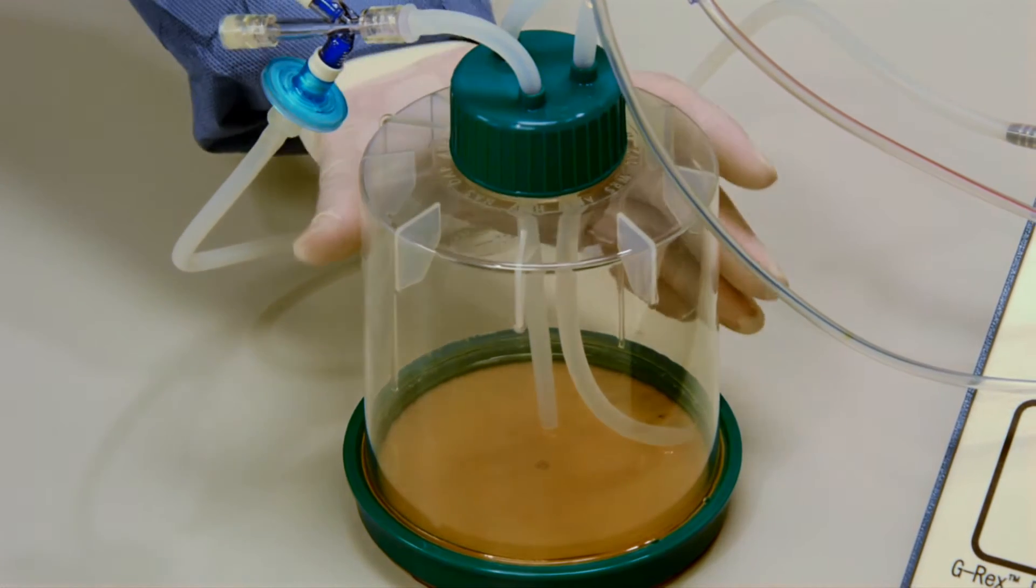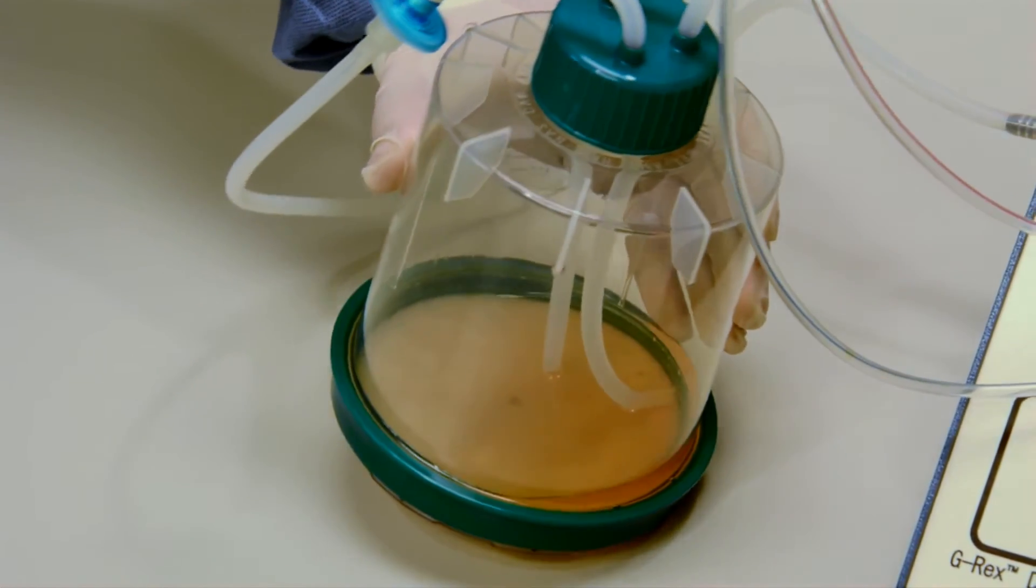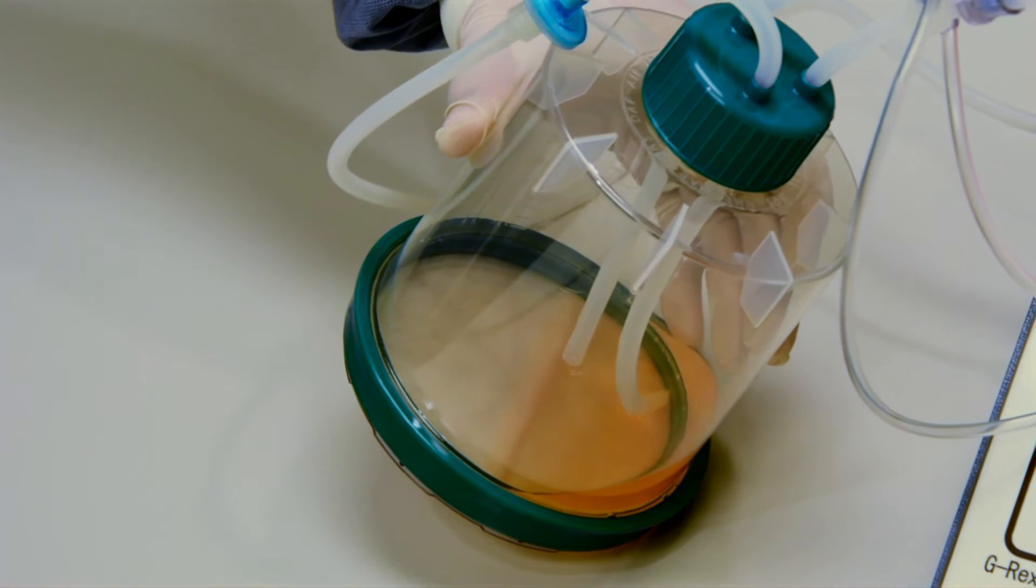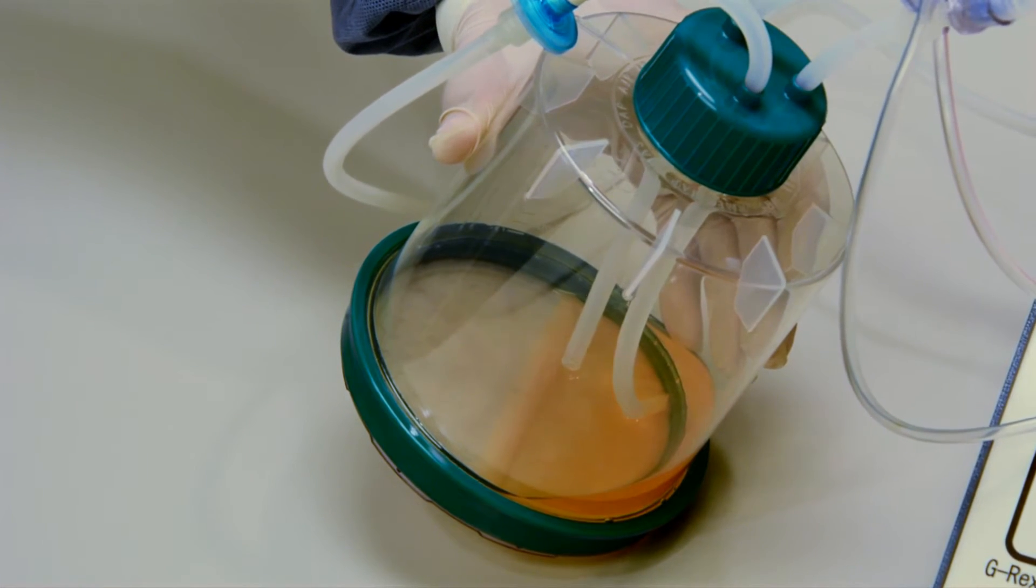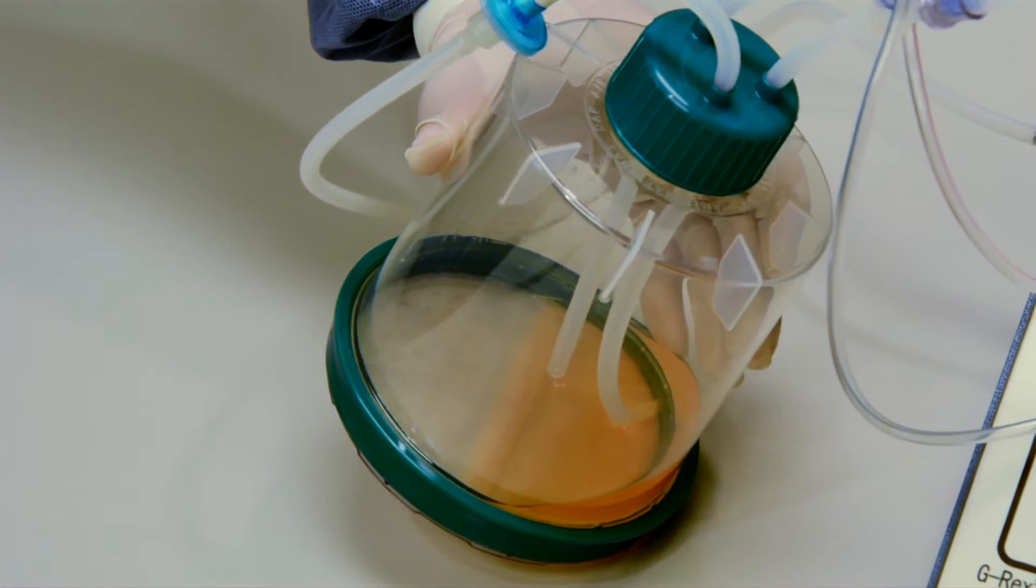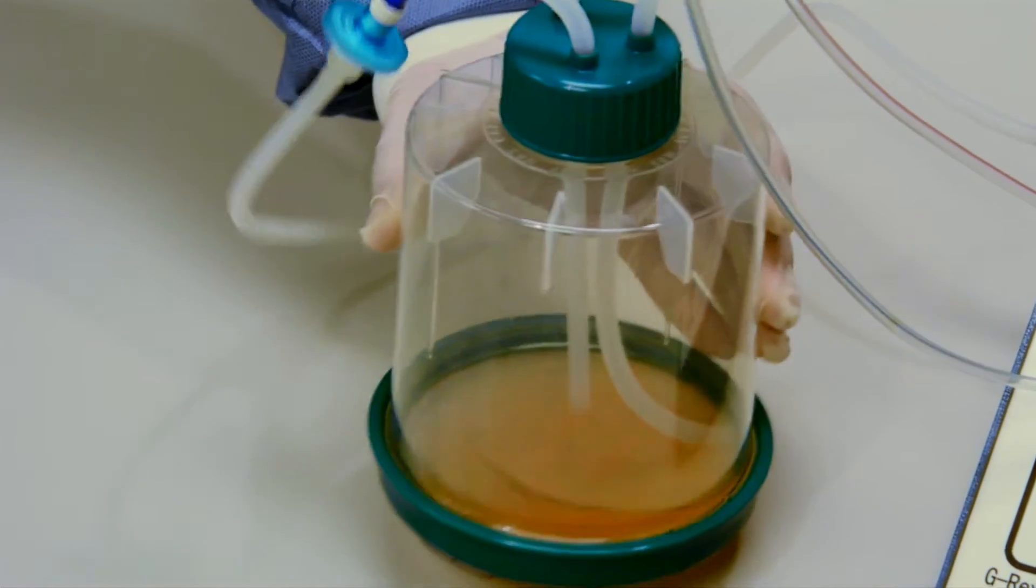When we tilt the G-REX, we can see the cells residing undisturbed on the silicone membrane at the bottom of the device, forming a loose carpet, which can easily be brought into suspension by swirling the flask.